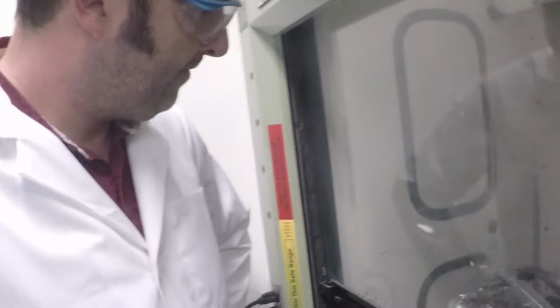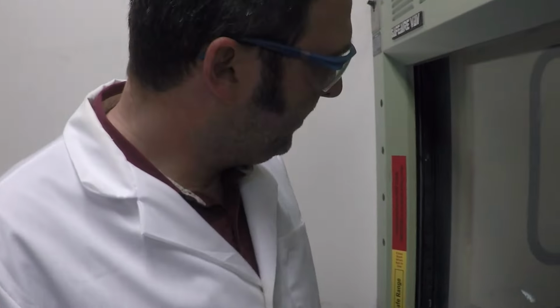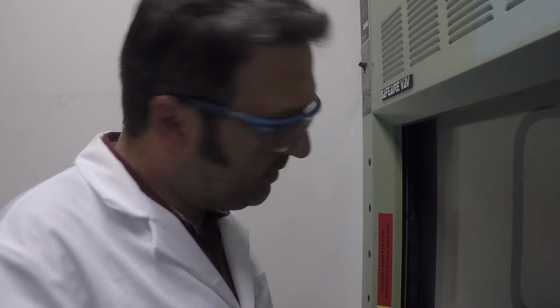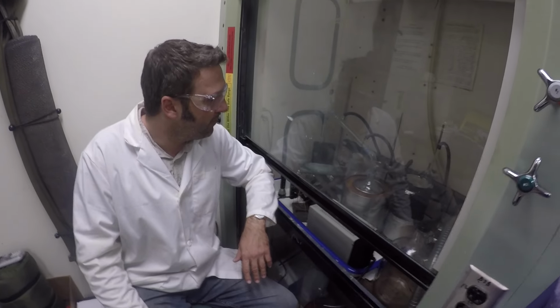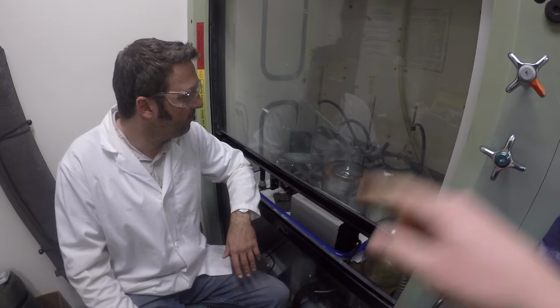That's right. I think we're good. You're good. So we'll distill this down completely today. Then if we have time, we'll set it up to at least run for tomorrow, distill it out again, and then we're ready for the next experiment. But from hazardous waste to useful material for science, it's a win-win. We have done a chemical clean, just the base level clean, and then we've done this distillation process twice.